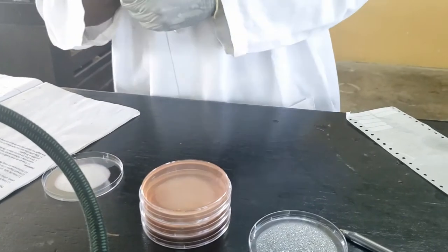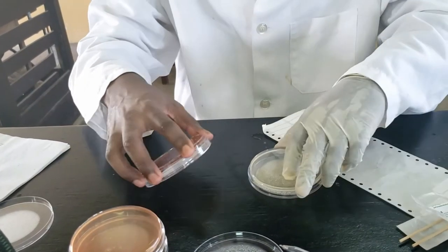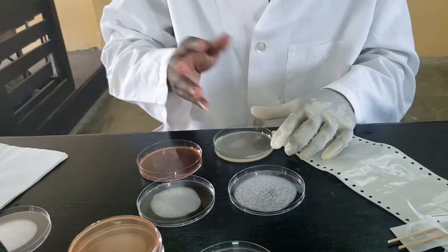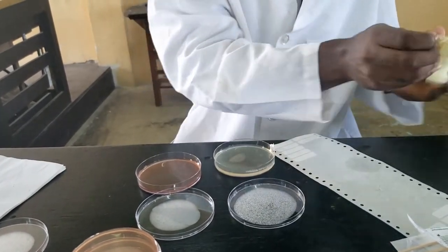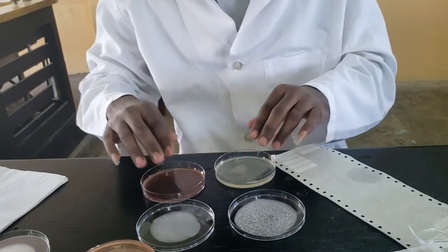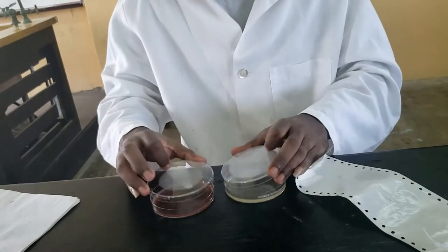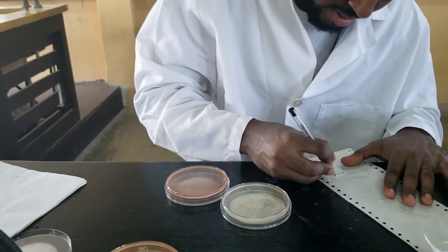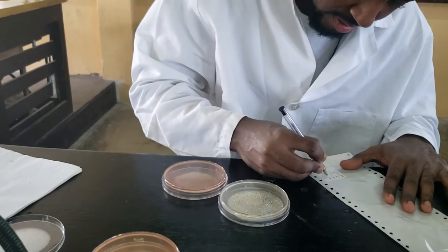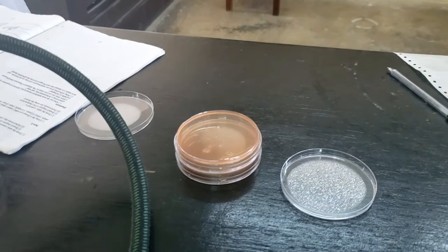Now my gloves are oily. Touch the agar surface lightly with your fingertips on each, and I guess I'll just touch. Give it enough touches. Hand, Luria broth, and hand, MacConkey. Let me just wash my hands.